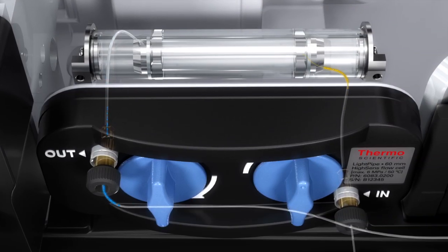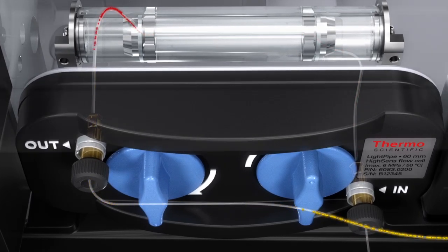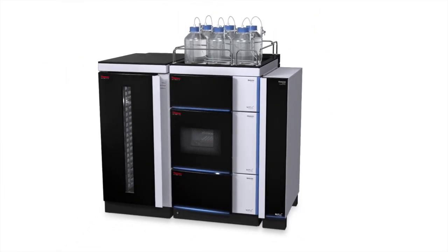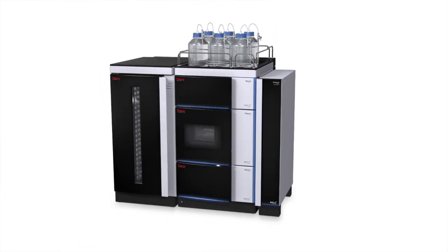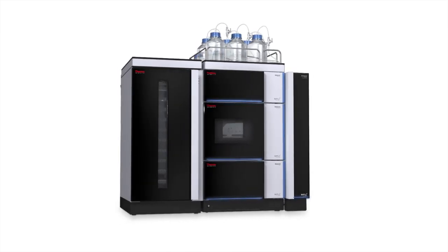200 Hz data collection will keep up with even the fastest UHPLC separations. The Vanquish system was designed to be an integrated system that addresses the needs of chromatographers performing state-of-the-art UHPLC. It appears as one instrument, but still offers the flexibility required by chromatographers in a clean, elegant design.